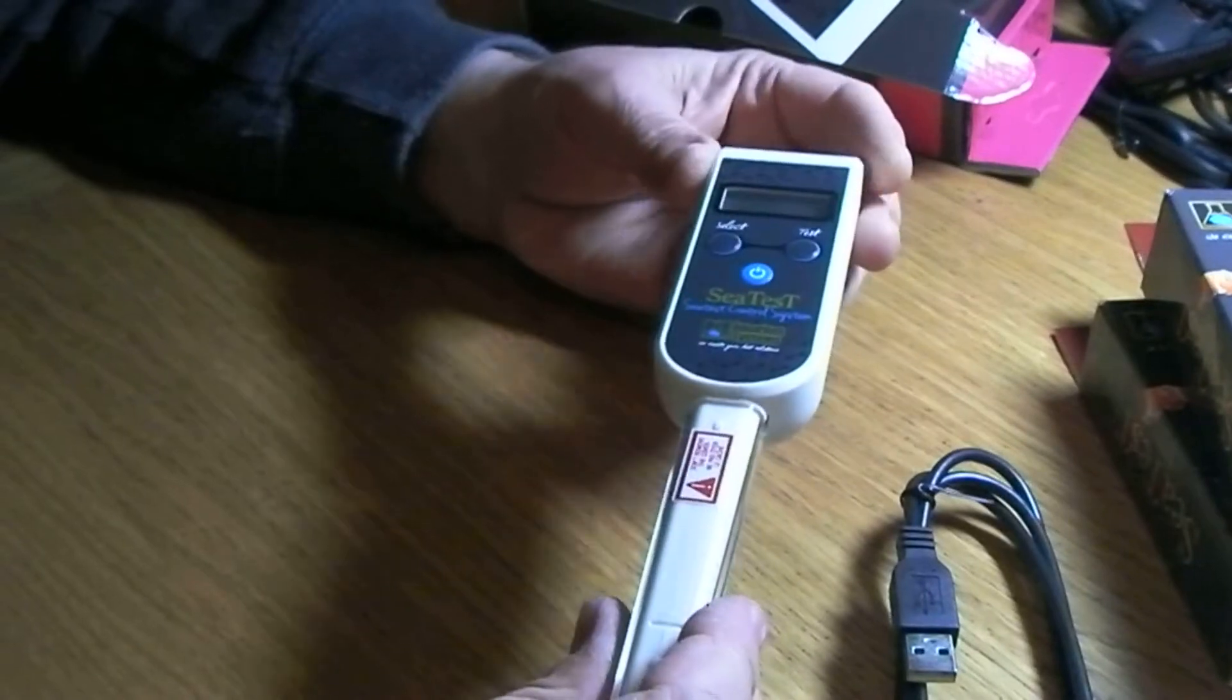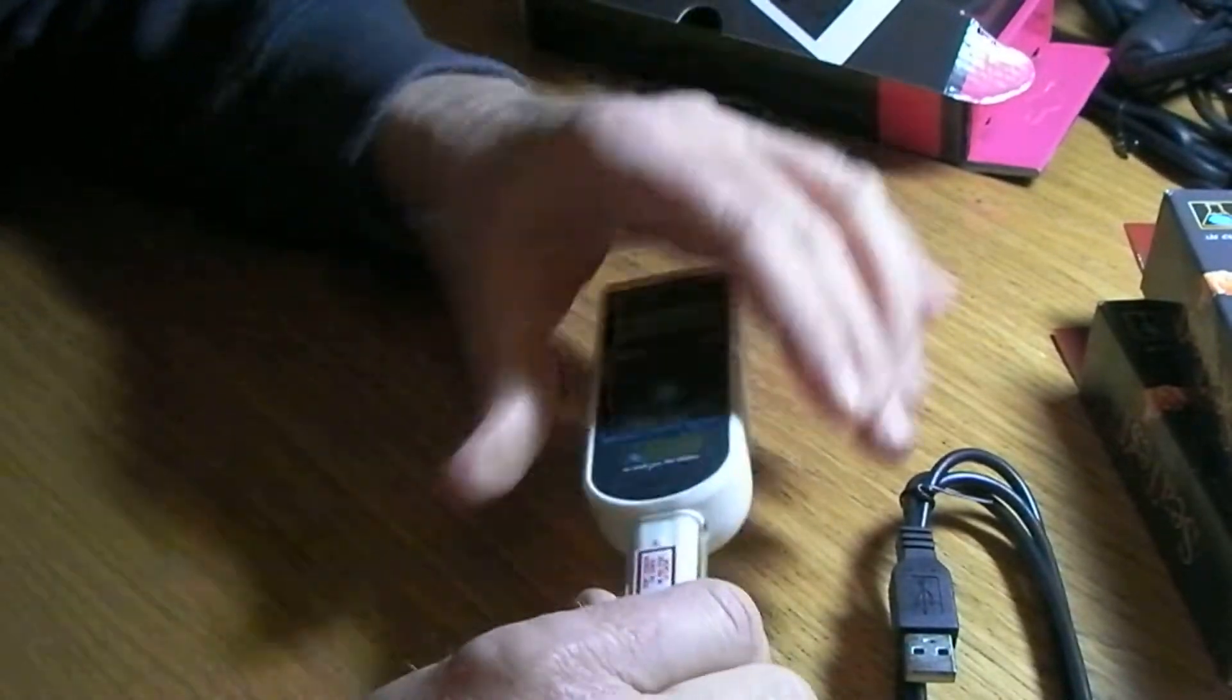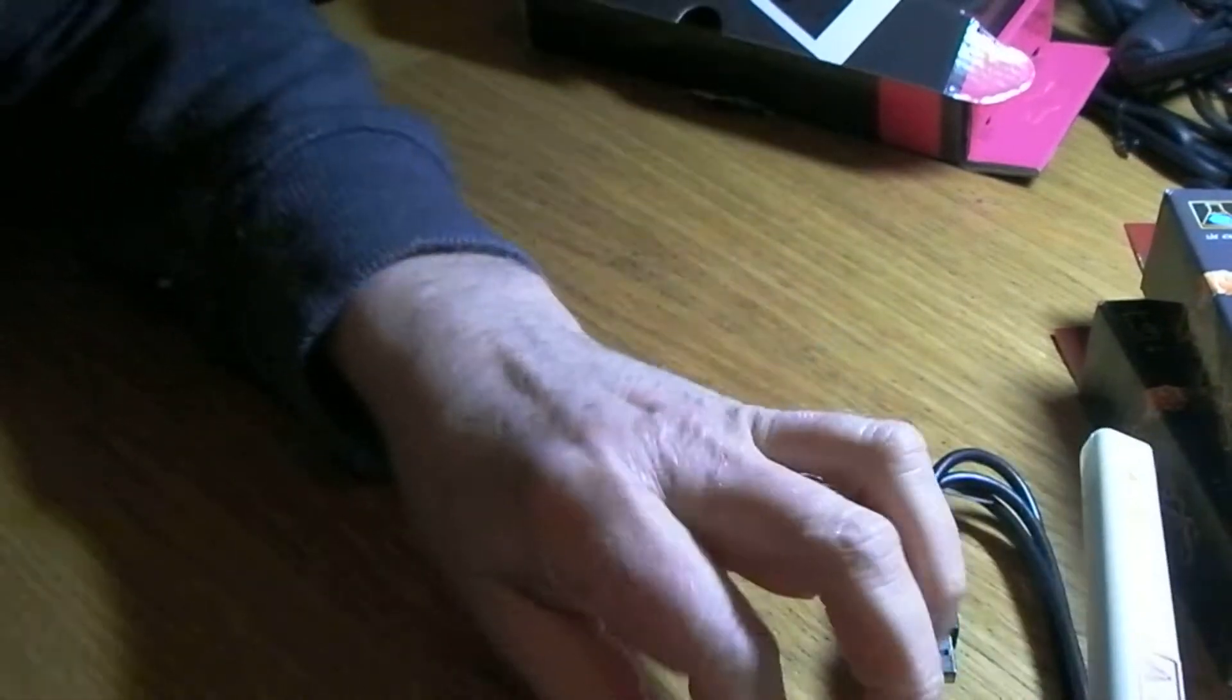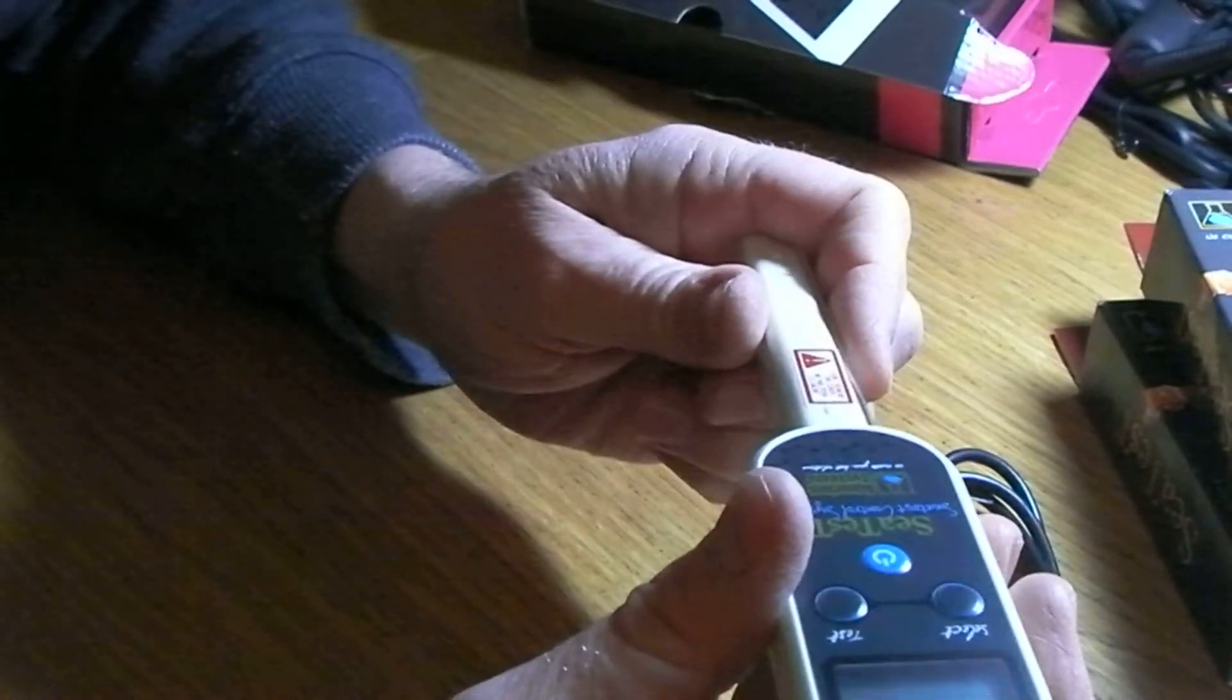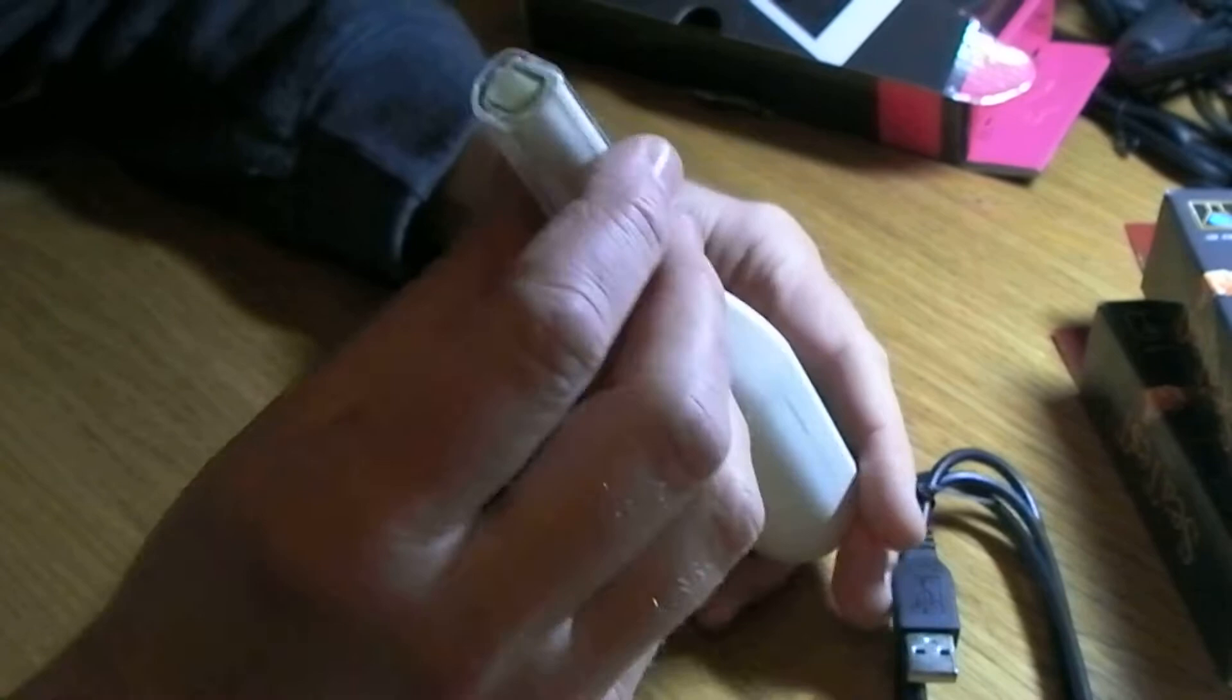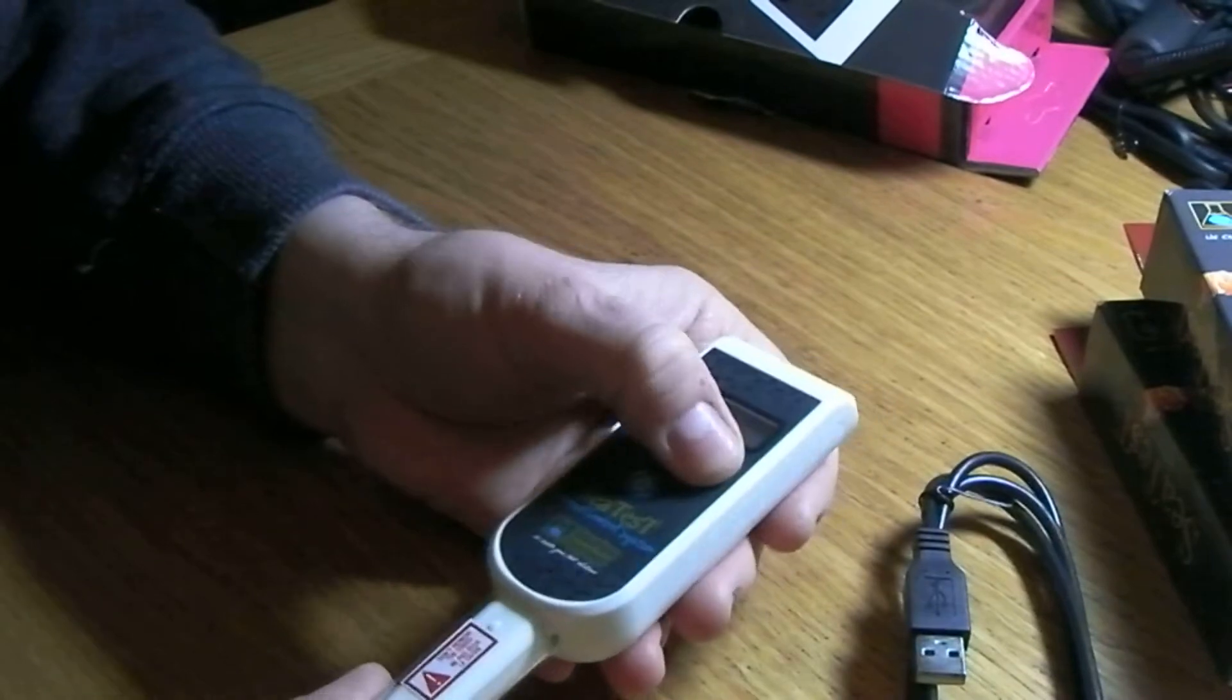Made in the UE it says rather than EU on the back, and there's a removable plastic cover for the probe. Something on here says do not remove the cover. I assume it doesn't mean that, or maybe it does. Perhaps I'll have to download the instructions and see exactly what you need to do, because there is a hole in there. Maybe you don't need to remove that, but if it's gonna get water in it you're gonna have to dry it and clean it. That's a quick look at the main unit. You've got select, test, and standby buttons.